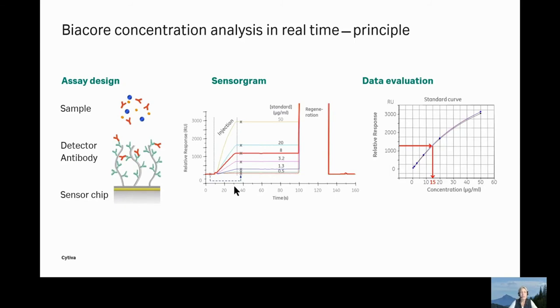You see here the corresponding sensorgrams from a calibration curve. So here, this is an overlay of the different concentrations injected. With increasing concentration, the signal increases, and these complexes which are formed are very stable. To get rid of them, because we always want to reuse the surface, the samples are regenerated with a high pH or high salt shift, and the complexes are opened, and the sensorgrams are then back to baseline. So we have an empty surface again.